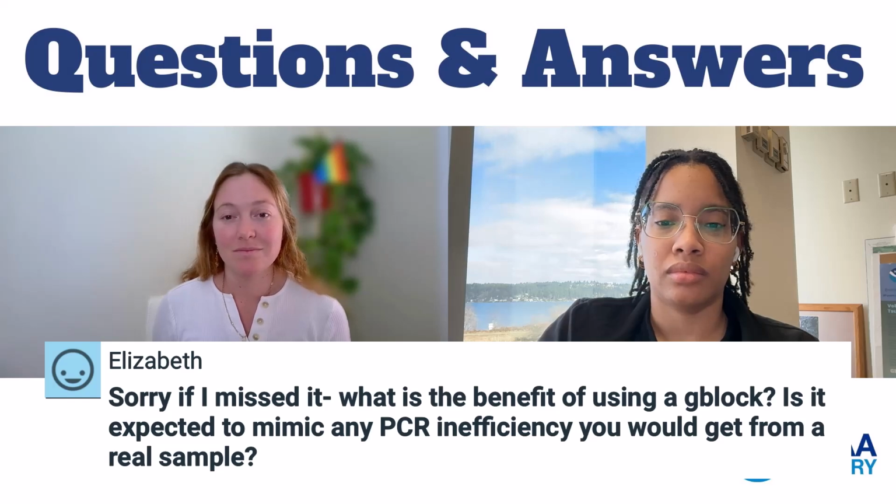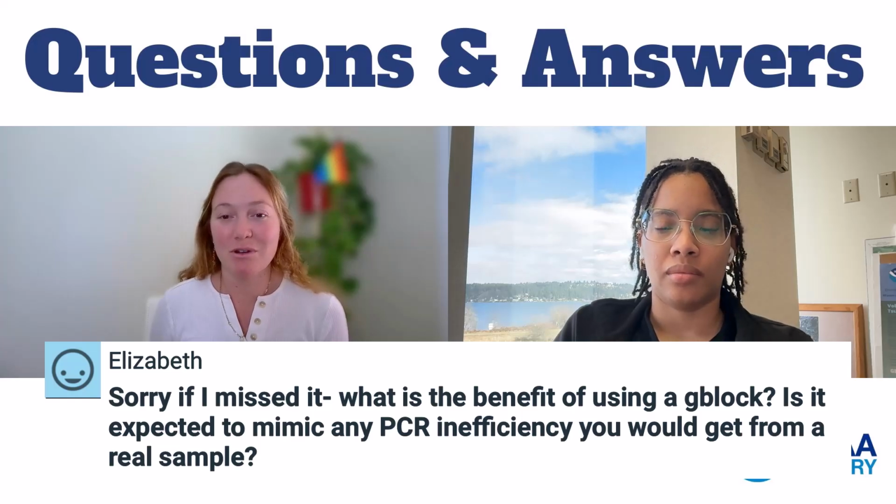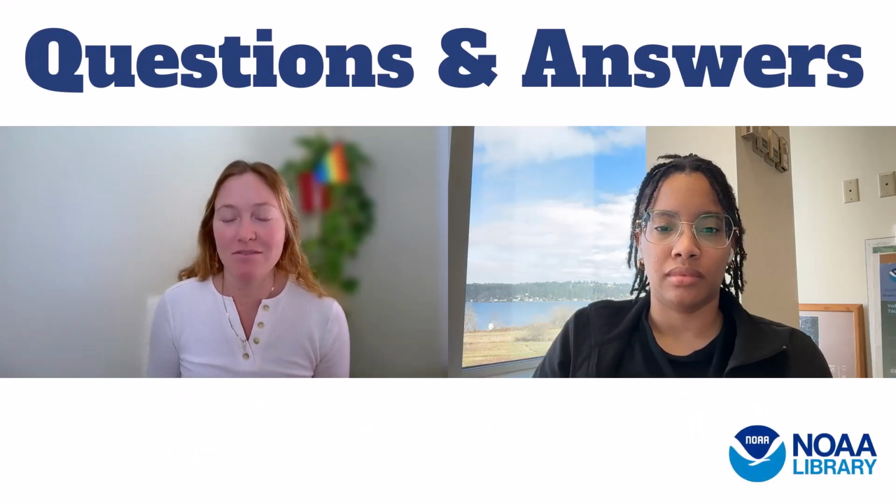So I believe you answered it. I do as well. Really, to echo what Dwan said, the gBlock, if I heard correctly, can improve our understanding of sensitivity of the assay.